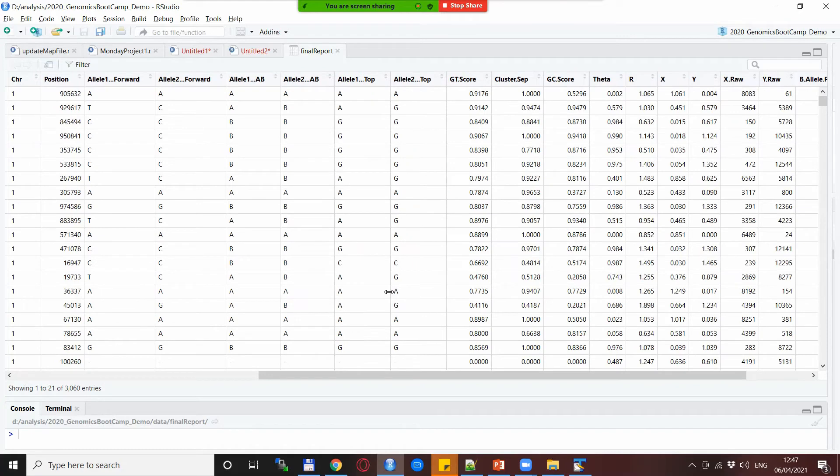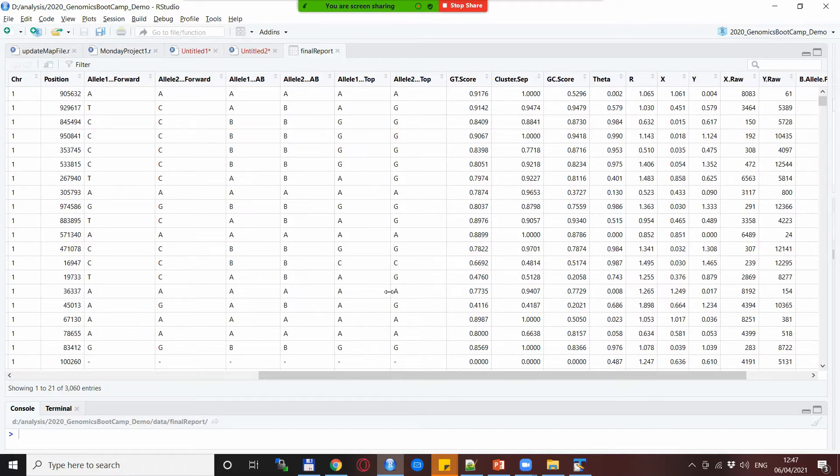Then here are some other interesting information that come from the genome studio that has to do something with the SNP quality itself. In some publications you might see an alternative for the quality control.